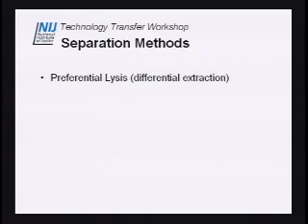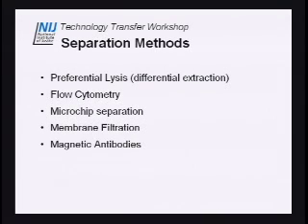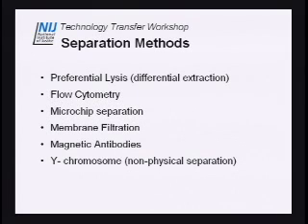Just a review, there are some different separation methods. The most common, and the gold standard used right now, is differential extraction, and Pat will go into that in more detail later. Other methods include flow cytometry, microchip separation, membrane filtration, and magnetic antibodies. Some of them have been successful, some not so successful. There's a lot of work being done on microchip separation, and I'm excited to see where that goes.